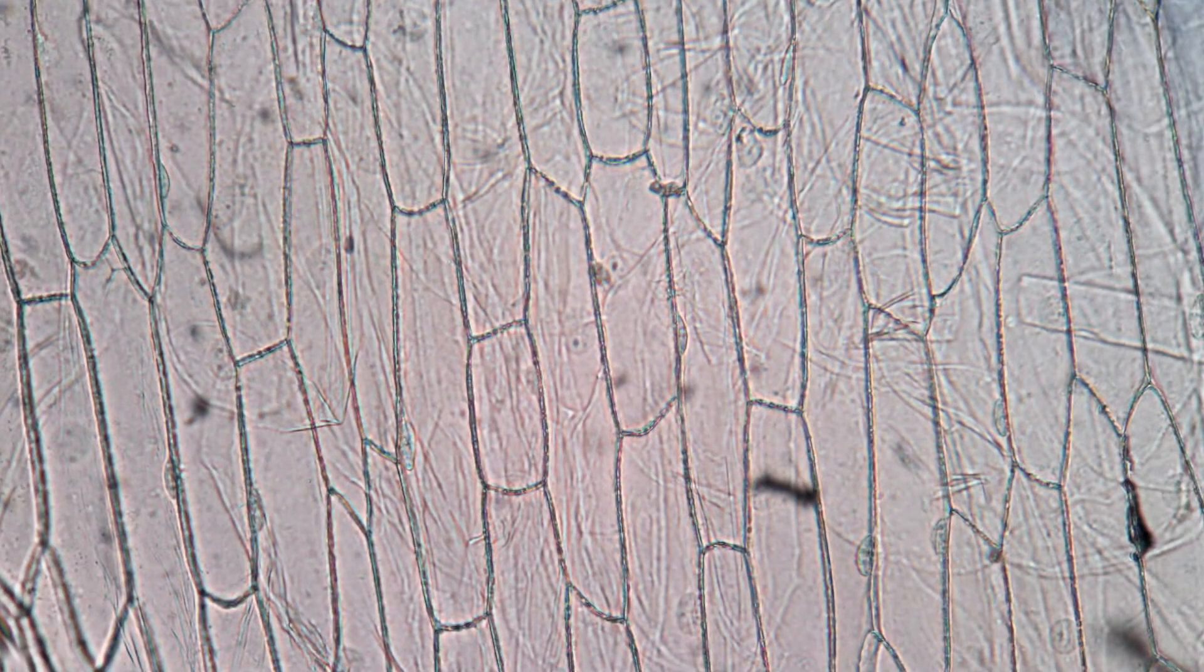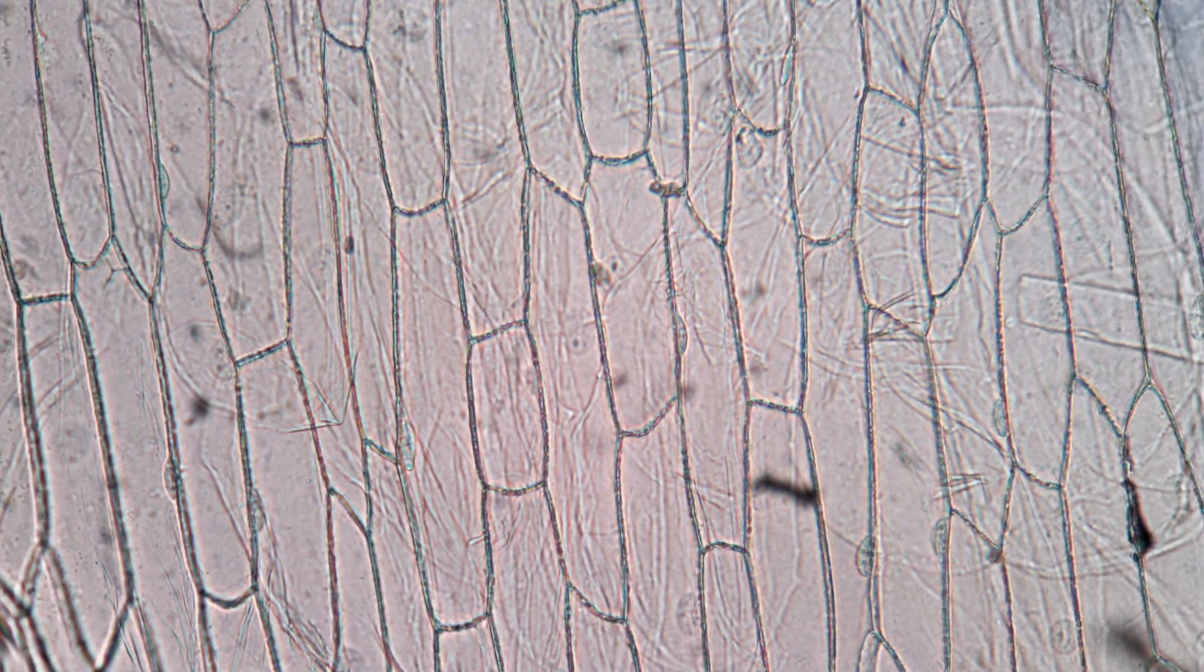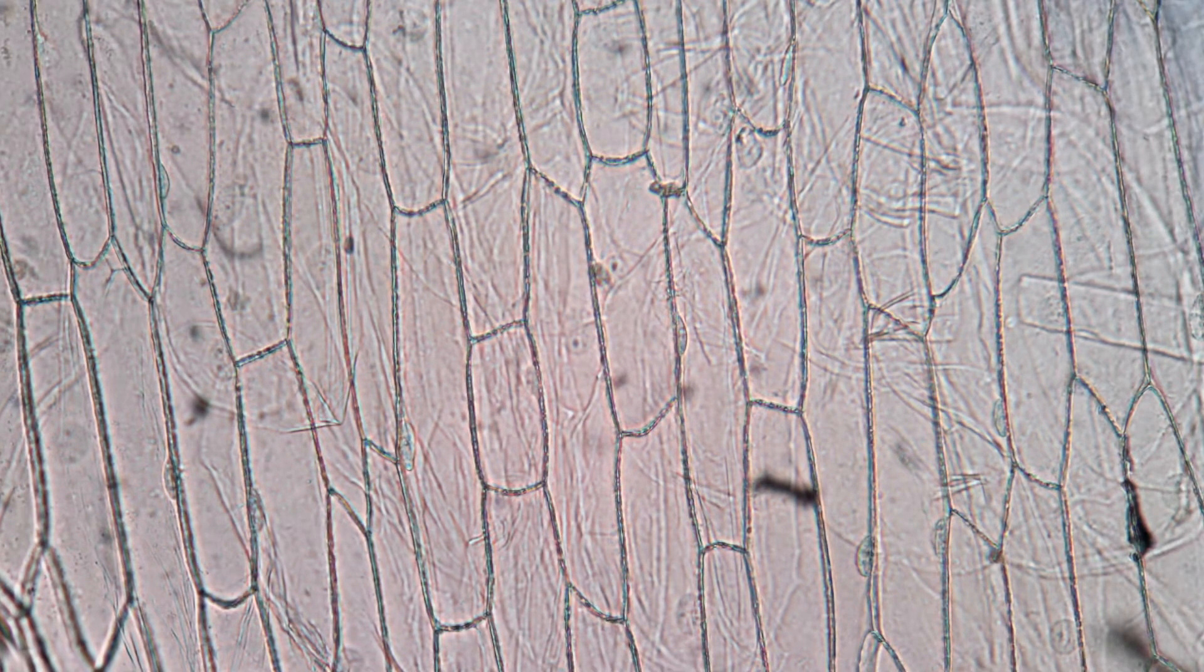A representative onion cell will be in a thin, unfolded area of epidermis with an obvious nucleus and visible nucleolus. You should also see cytoplasmic strands through the central vacuole.